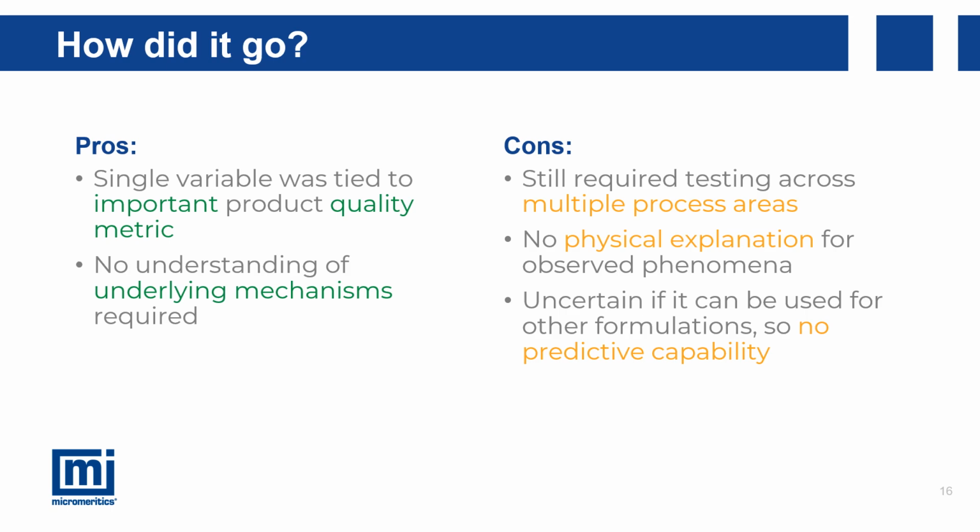However, it's not necessary for us to understand the physical mechanisms involved. We have identified a good sampling point, and we've been able to use a single test result from that sample point to predict our tablet hardness.